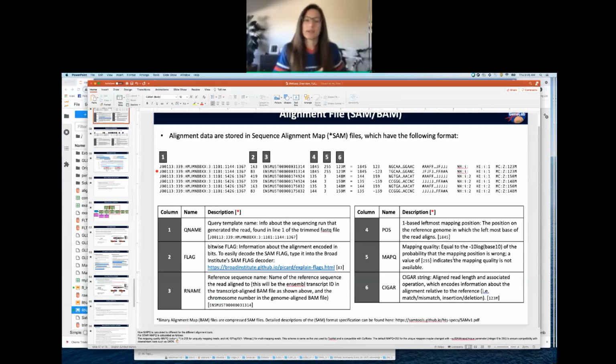It's also specific to some other alignment tools. The way that the mapping quality score is calculated is unique to each specific alignment tool that you use. So depending on the alignment tool you use, you'll get a different mapping quality score. As I was reminding myself of this stuff last night and looking things up, I found quite a bit of forums with some angry bioinformaticians about this not being streamlined and consistent for all alignment platforms. So if you're ever looking at a couple of different experiments or studies, make sure you know how they did their alignment before you make any conclusions based on the mapping quality.